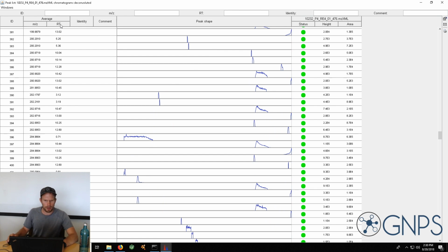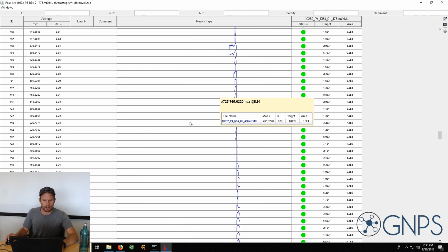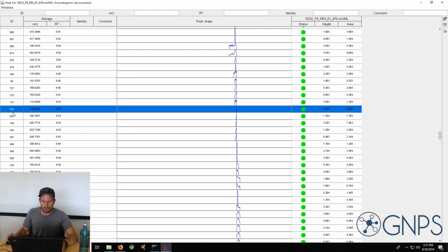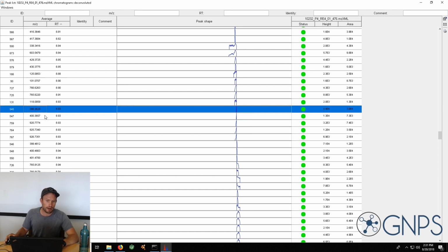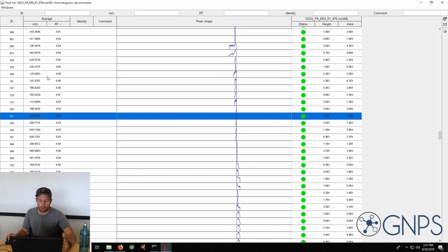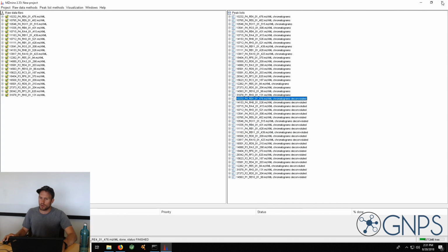If we now sort by retention time, one thing you can see very easily is that we have many peaks with the same chromatographic shape, which differ in this case by 1, 399 and 400. These are of course isotope peaks and represent quite some redundancy in our data. To remove this, in the next step we want to group them together in isotope envelopes.